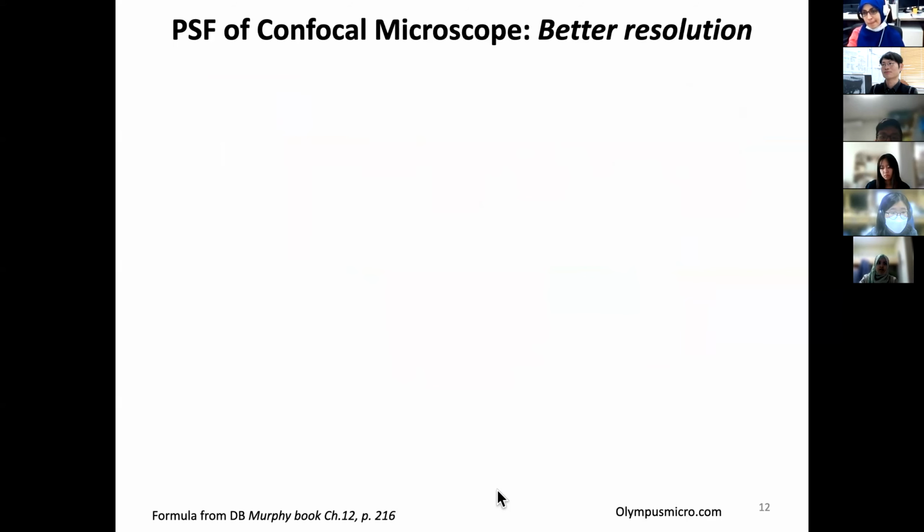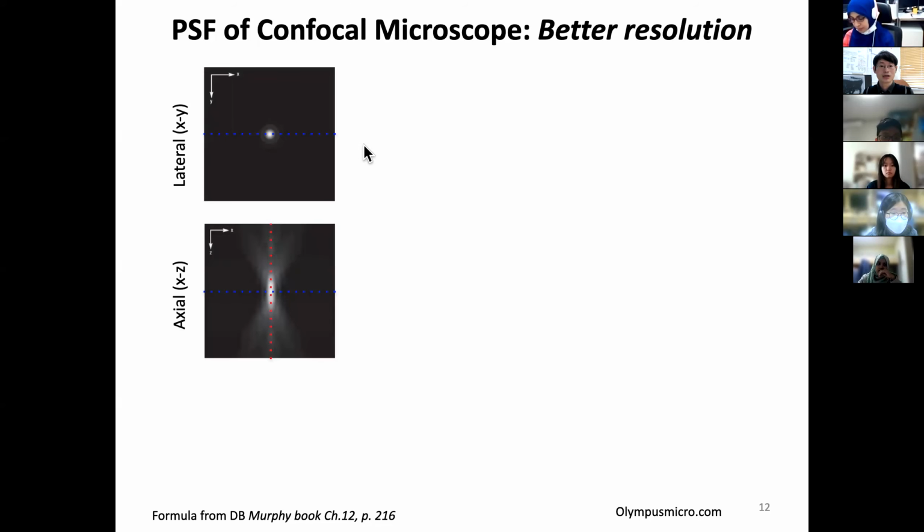All right, so let's go back to the resolution issue of confocal. Initially, I said many biologists love confocal microscopy, or now probably super resolution microscopy, to see even more detail in 3D. What is the shape of the interaction of the molecules and fluorescence and cell organelles and cell-to-cell interaction. And that requires good resolution. So I want to bring experimental data.